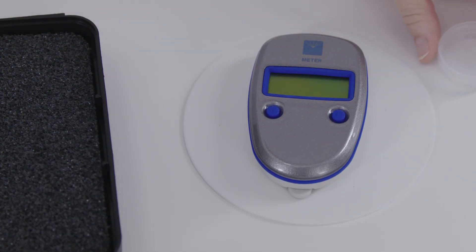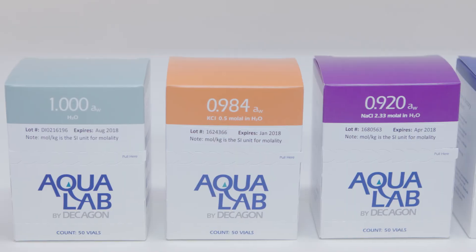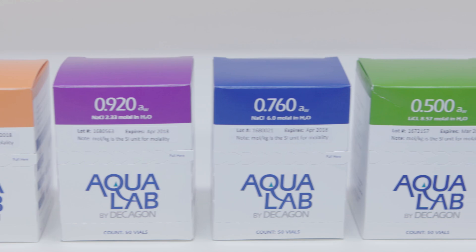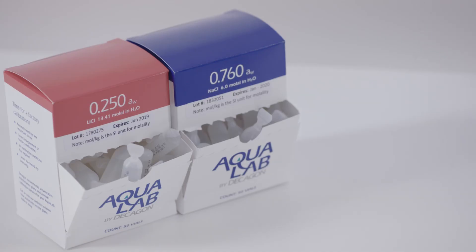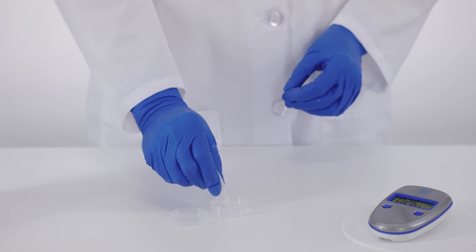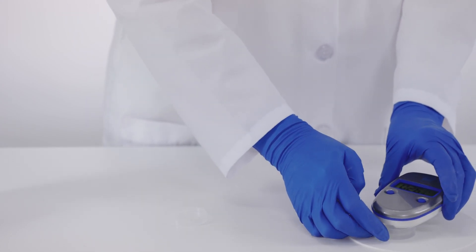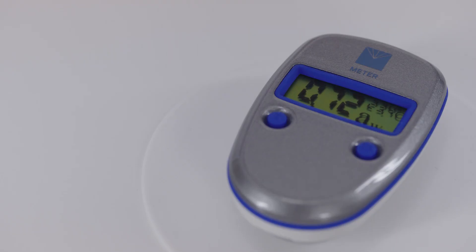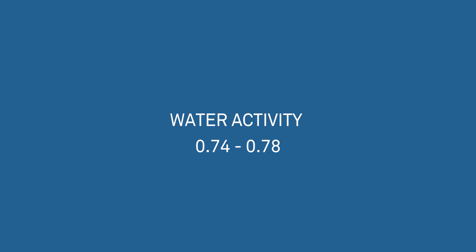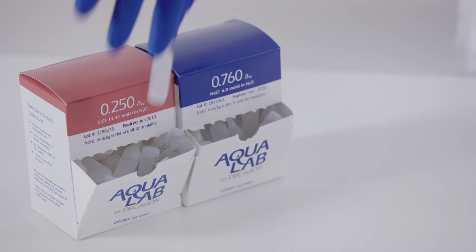The pocket uses a two-point calibration. To perform an instrument verification, wash your hands or put on lab gloves. These verification standards are salt solutions with a known water activity value. They are tested with a densiometer to validate their accuracy. Standards are good for one year. Cover the bottom of a sample cup with a .76 standard solution. Place the pocket on top of the sample and start the reading. If it's not in spec, clean your instrument. The standard should read between .74 and .78 AW because the pocket has an accuracy of plus or minus .02 AW. If it's in spec, you can move on to the .25 or .92 standard and complete the verification.